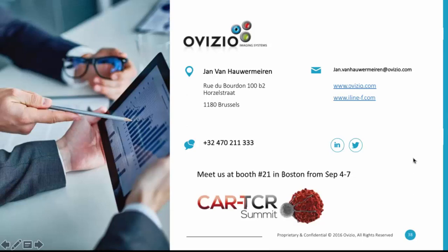You can even in the software click on one cell in an image and it will give you all the 70 results on the parameters. You can export it in a huge Excel file which contains all the parameters on every single cell that passed through the imaging camera. So that is possible. We are as well working, but then I'm probably talking 2022, on a device that's capable of handling offline samples as well.